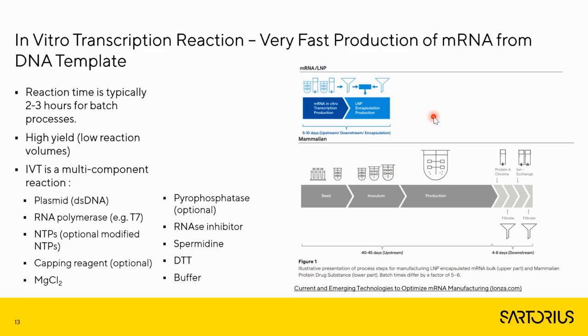The key and most important, also most expensive unit operation or process step used to produce mRNA is the in vitro transcription reaction, IVT. And it's a multi-component reaction. It's quite a complex reaction, and yet at the bottom of it, it is not a biological process. It's in fact a chemical reaction. And I think as an industry, we would do well to think about it as such rather than a biological process, which it is not. It is a reaction that typically takes about 2 hours. We try to speed it up if possible.